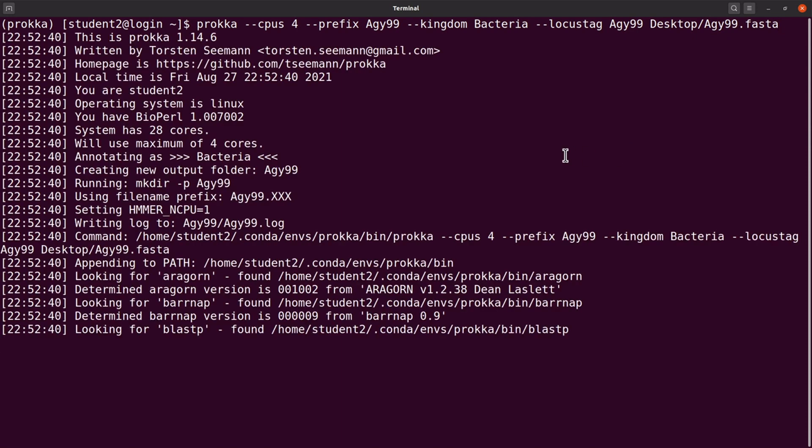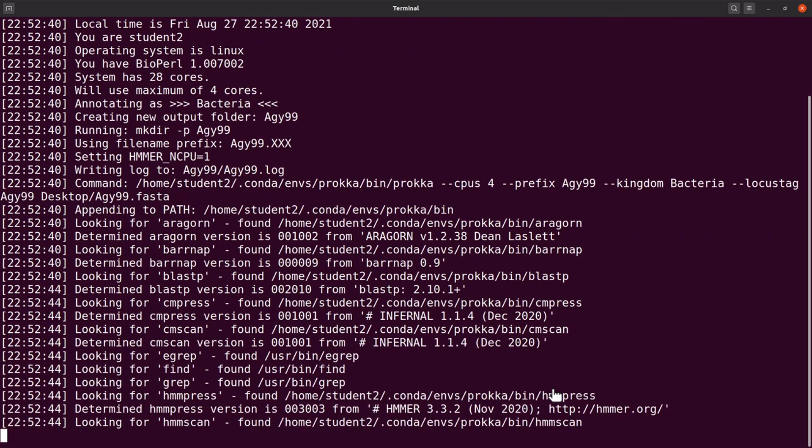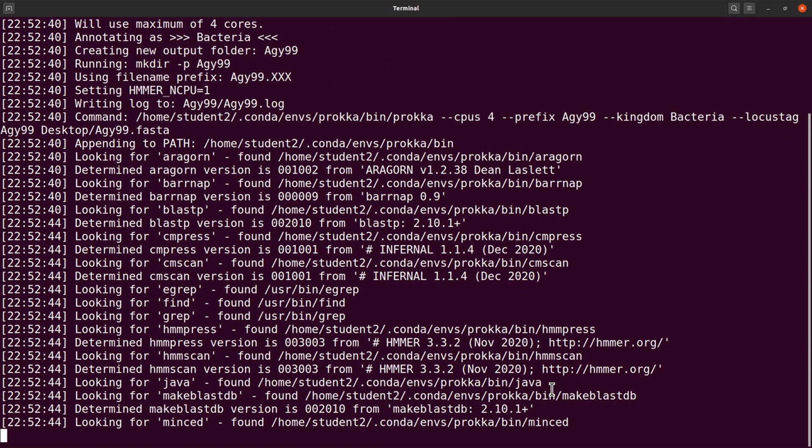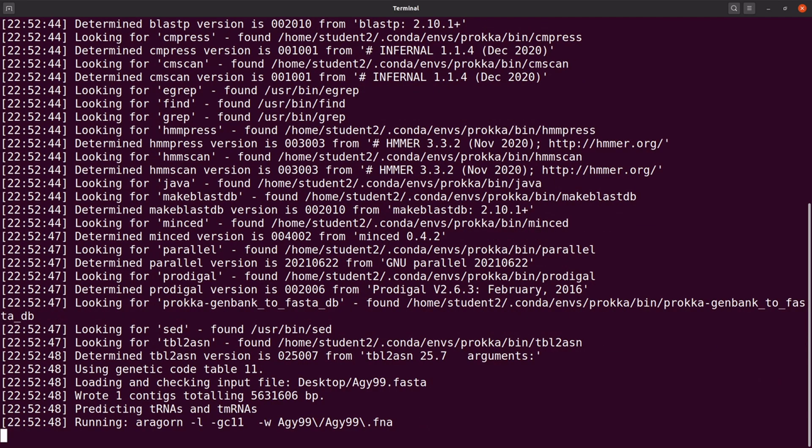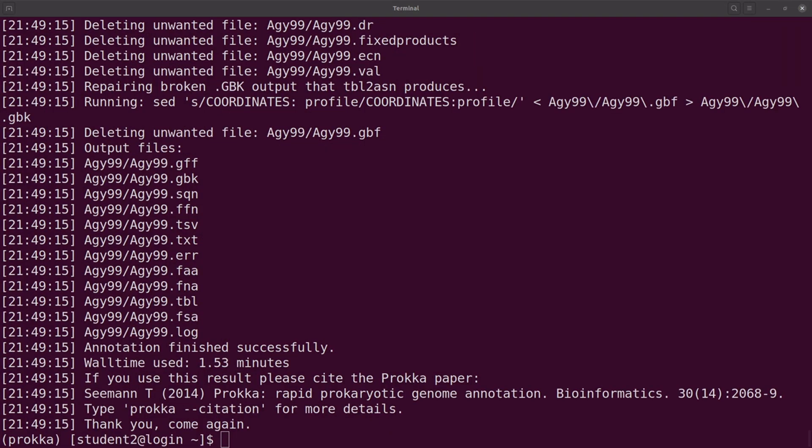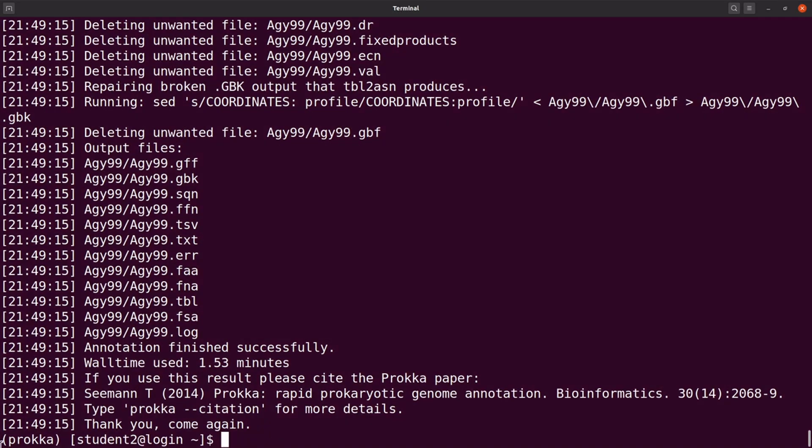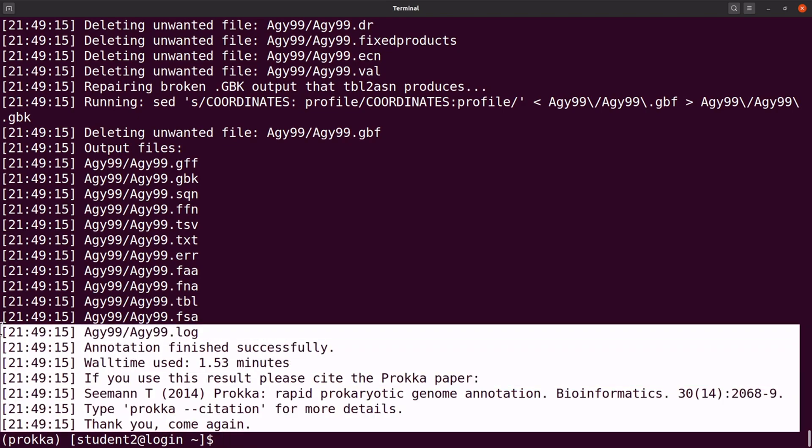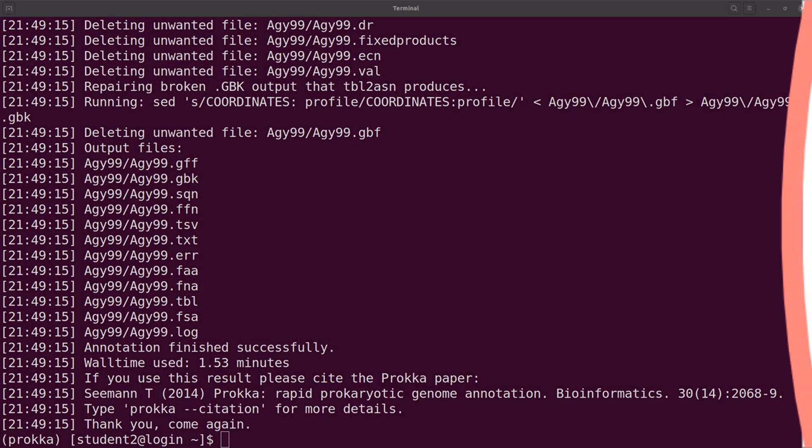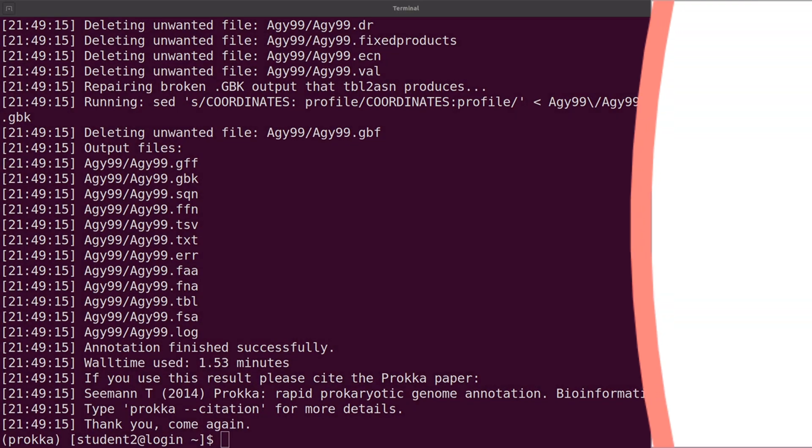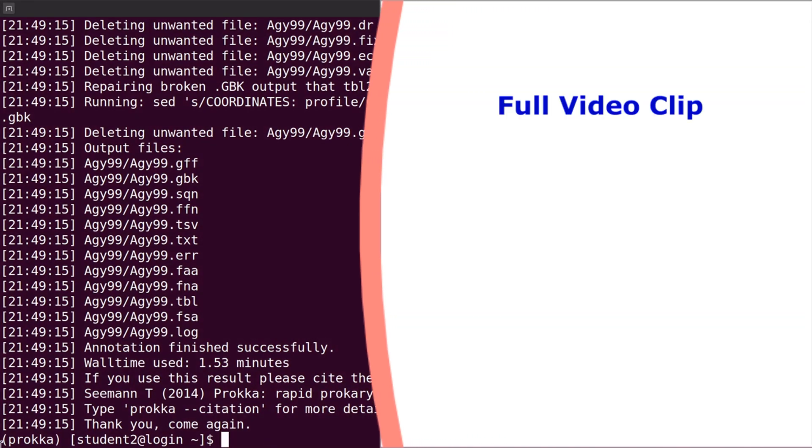So let's run it. So now annotation has started. So let's wait for it to complete. So the annotation has been finished. That is why you have this here. It was successful.